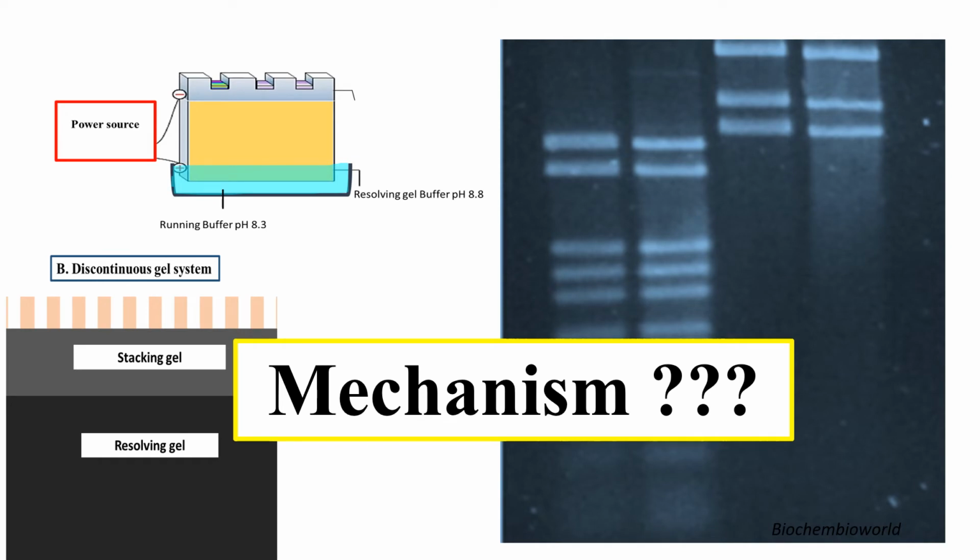So I have told you the basics, the buffer system, what is the use of the stacking gel and why we need it. The next question here is the mechanism of this discontinuous gel system. I'll be giving an overview of this mechanism in this vlog.